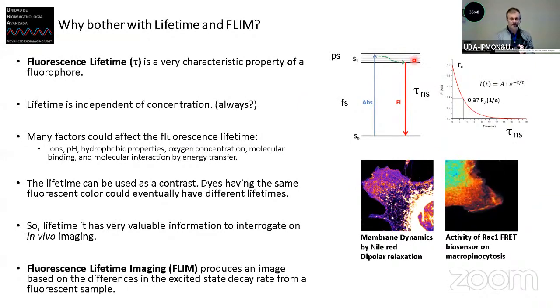And lifetime is also nowadays a very powerful tool to multiplex, because you can have many fluorescent molecules, even with the same fluorescent color, but different lifetime. And you can take advantage of that.